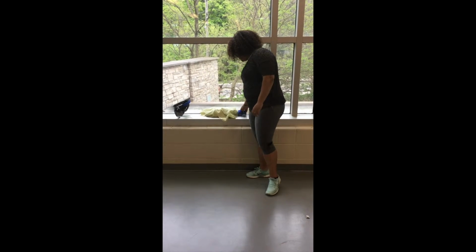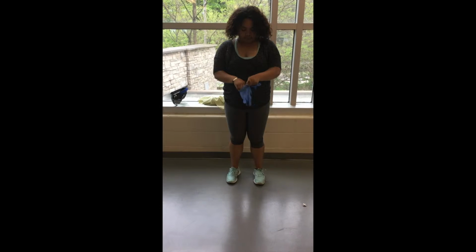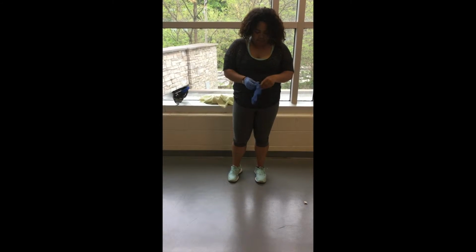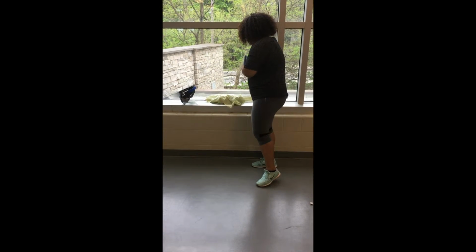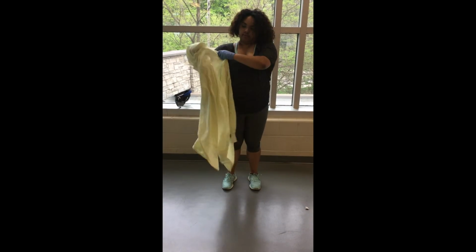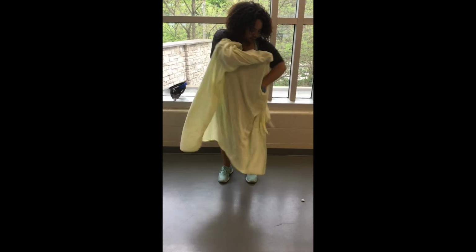I'm going to teach you how to prepare yourself to go into a droplet isolation room. So first, you're going to want to put on your gloves. Make sure you grab the right size so they're not too tight or too big. And then, you're going to want to put on your gown. Make sure you tie it up in the back. And that it's a comfortable fit.